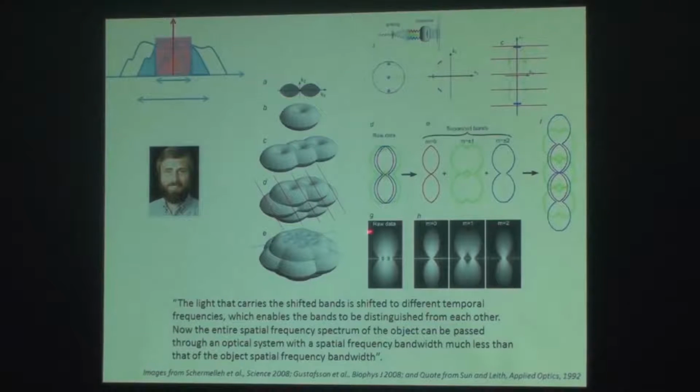So how putting the information back works is, as you see here, the raw data, and these are the 5 images I have acquired at 5 different phase gratings. The raw data looks mixed, as you see here, because every frequency is in one particular location.